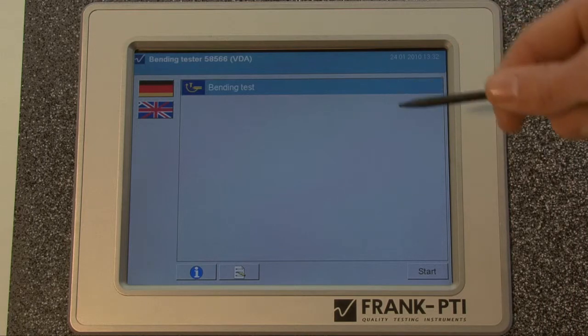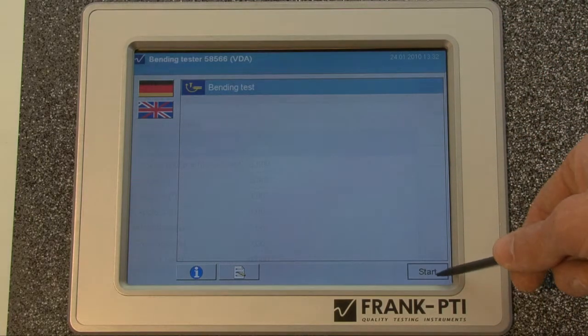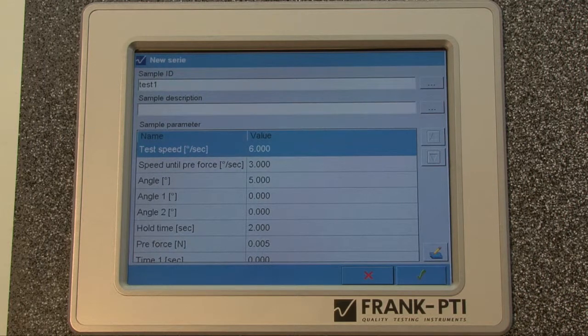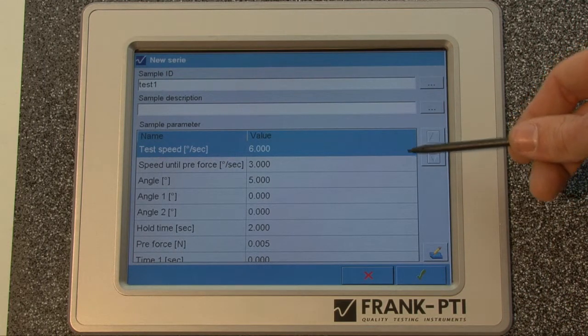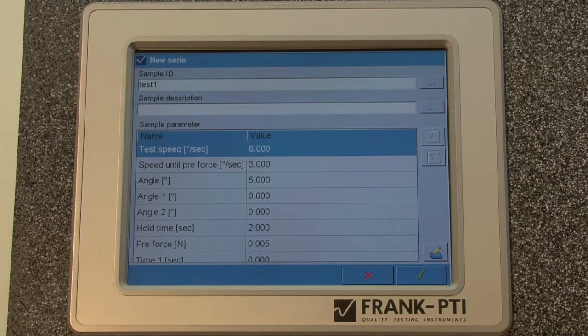Then you have to choose a testing program and tap the start button. On the next page you can see all the parameters. Change them to the parameters of your paper. I will leave mine to standard for now. Then tap the green tick.